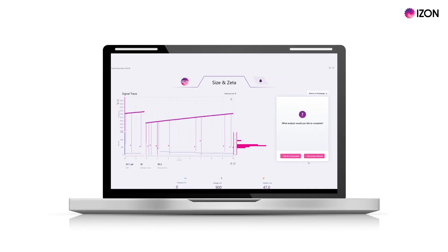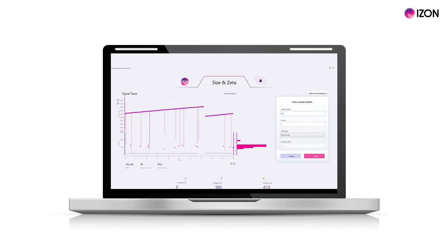Select the size and zeta potential button and fill in the details of your sample. The nanopore zeta value will be automatically filled in if you are using one of the electrolyte options listed here. Select done to continue.